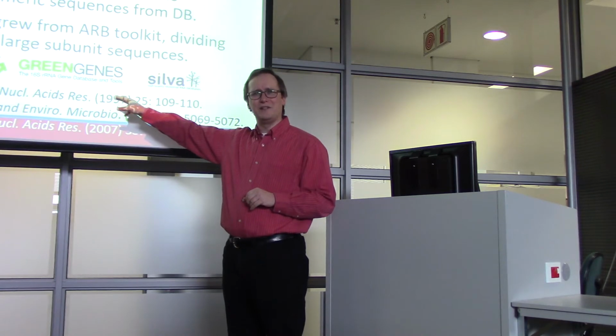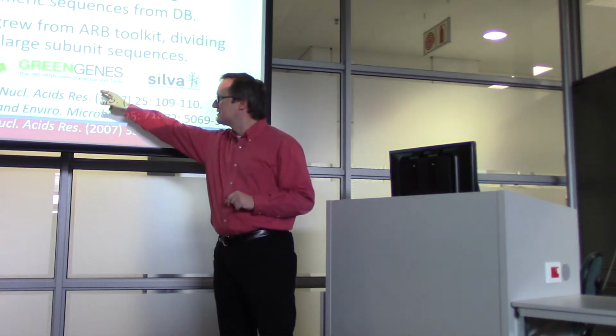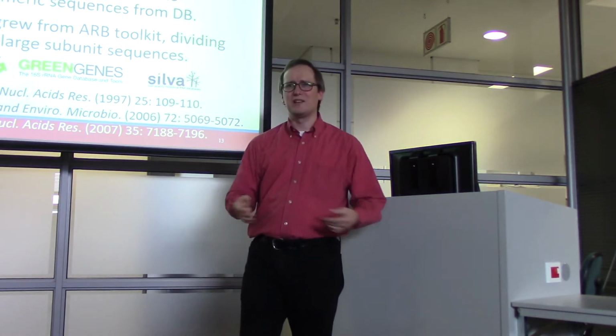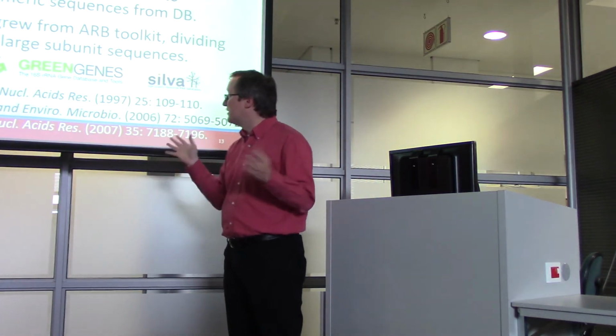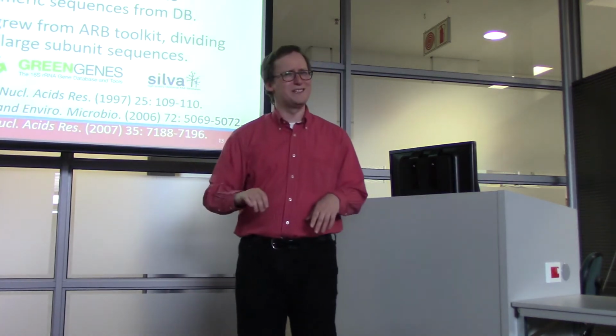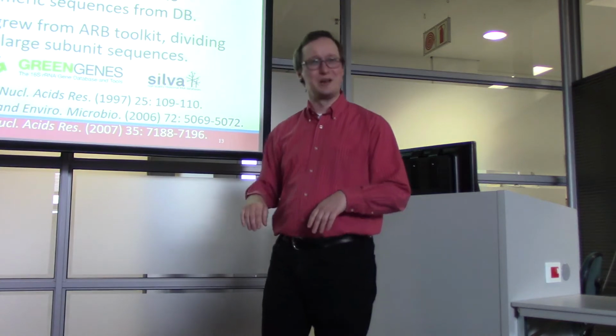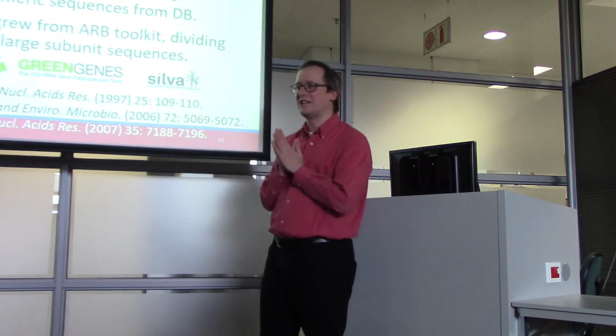Oddly enough, LBL, Lawrence Berkeley Laboratories, did not make this logo show up when I hit their website. Maybe they're just having a down day or something. But this logo is out there, and it's a nice one. It's the 16S rRNA gene database and tools. Always nice when you can say you are the database, right? And then Silva, high-quality ribosomal RNA databases.